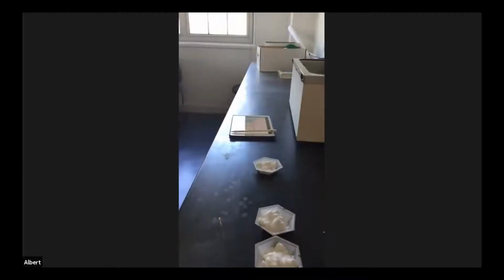So that's sample 1. Sharpie. No, it's here somewhere. All right, so just take the top off, sit that down in there. That way we don't get them mixed up. That would be horrible, to do all this setup and then mix the sample.